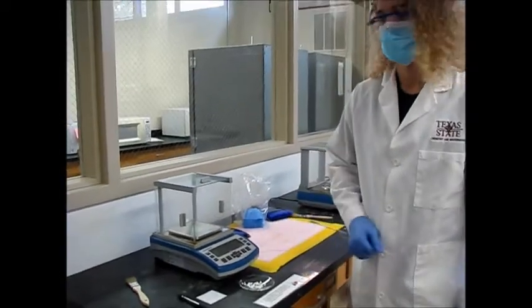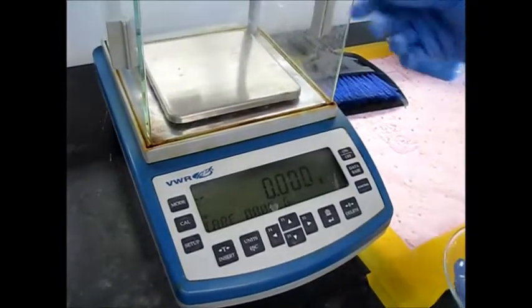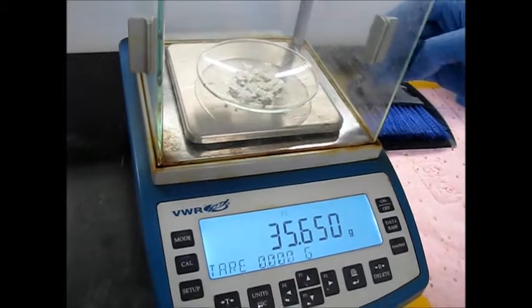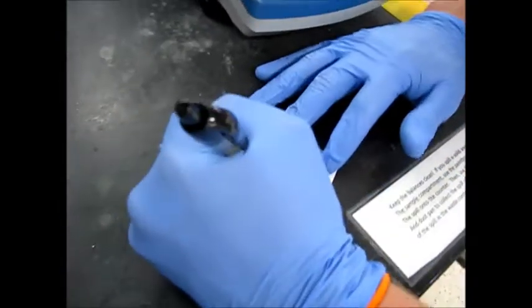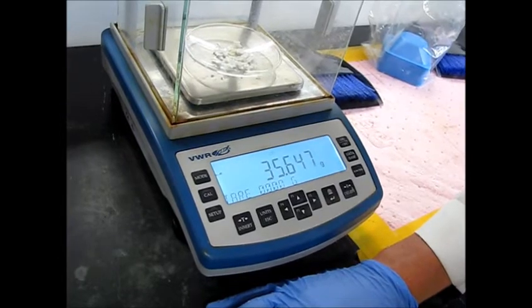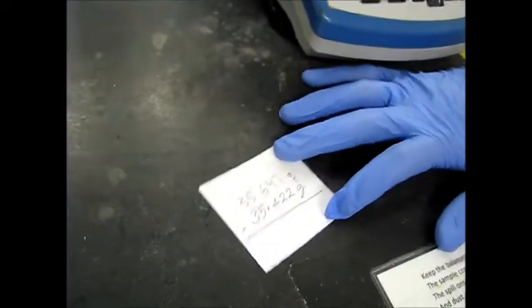So we weighed the watch glass beforehand, before we even started the vacuum filtration. We got a mass of 35.422 grams. So we'll be subtracting that mass from the mass we get right here. Make sure that it's zeroed out. Go ahead and get this weight. 35.647. Awesome. So we'll go ahead and write that down. 35.647 grams. So to find the actual mass of our product, we'll take the difference of these two.